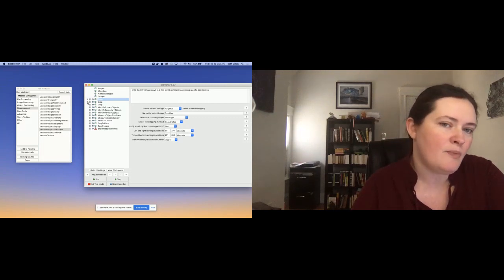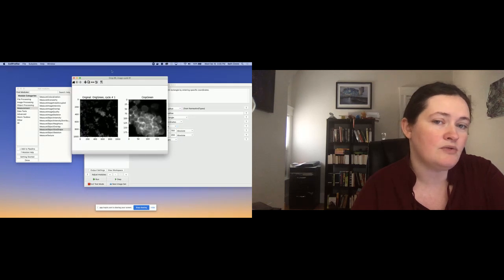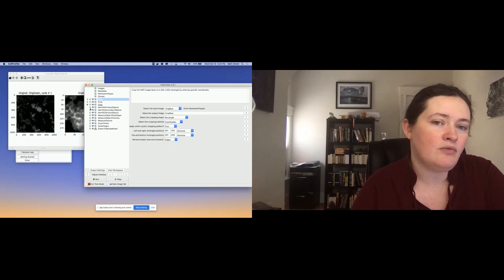The green arrow points at what's going to run next. The gray arrow points at everything that's already run. And these are pause buttons. So what I can do is, when I want to execute modules, I can say step, and it will just do one more. Or if I hit run, it will go until it hits a pause button.